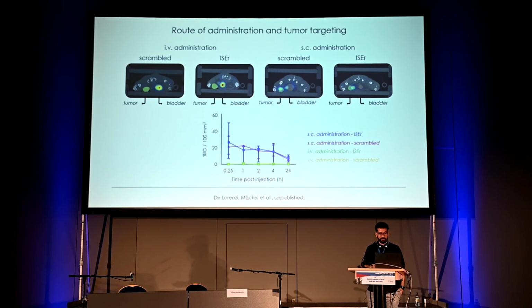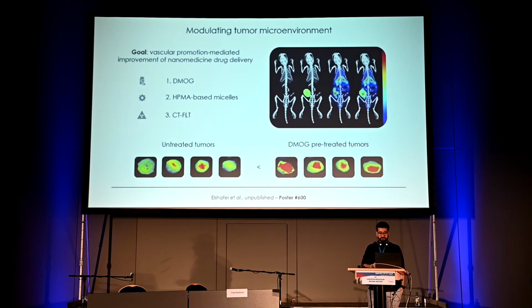Another application, since the FLT-CT device allows us to monitor small changes in the fluorescence in the tumor microenvironment, and we have this nice project that exactly reflects that.